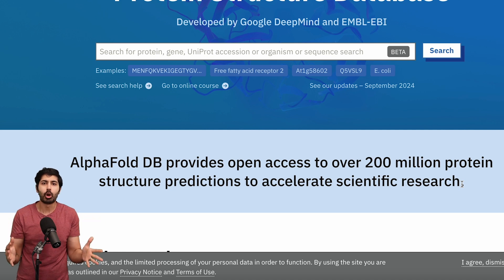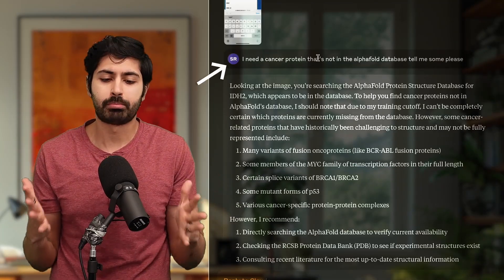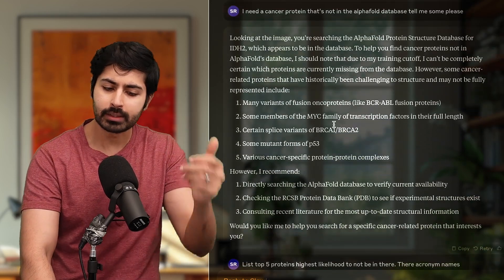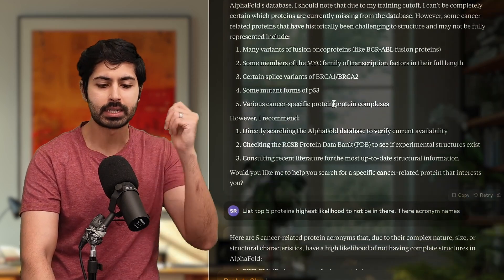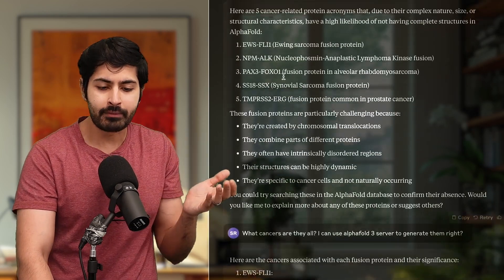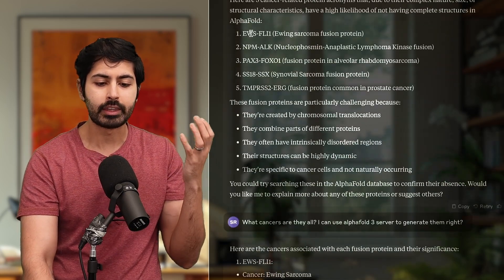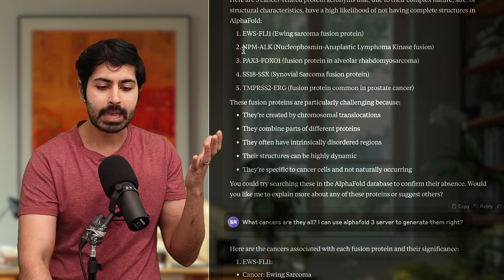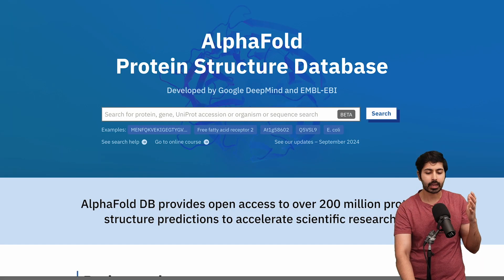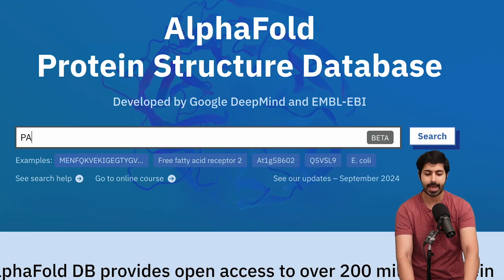But not every protein is in this database. So I asked Claude — I said I need a cancer protein that's not in this database, and gave it a screenshot. It suggested a few different proteins that might not be there, so I said list the top five. It listed five of them — all acronyms: NPM, ALK, PAX3, FOXO1. I then systematically checked the database for all of these; I'd go to Claude, see what it's called, type it into the database like PAX3 and check.